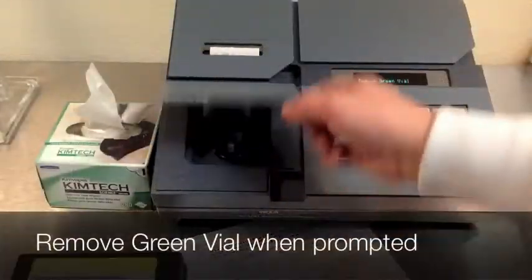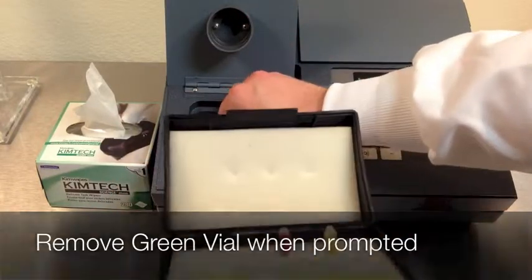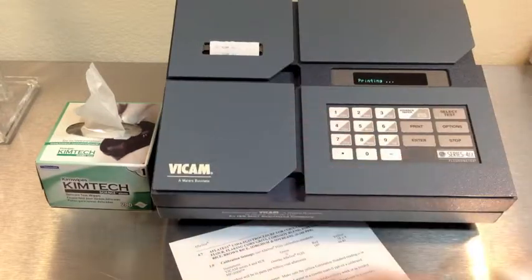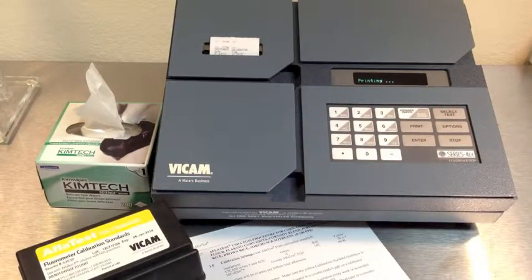The machine will now produce a printed receipt of your current calibration settings. Keep this for your records.